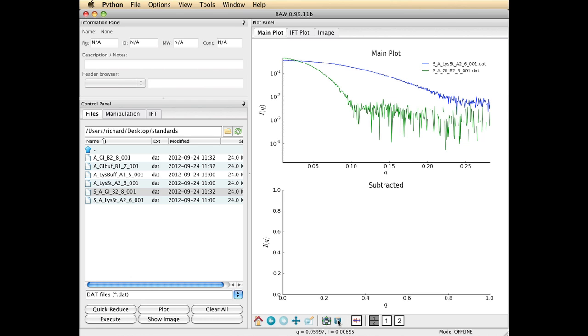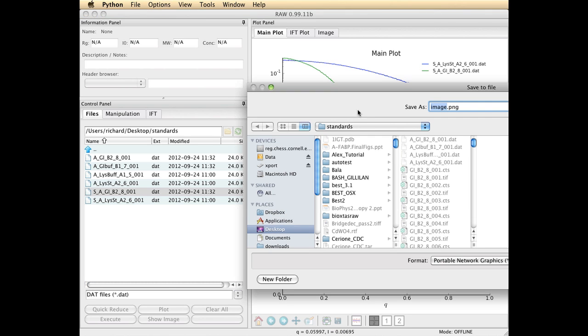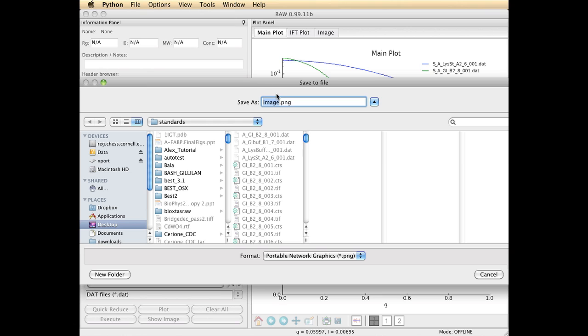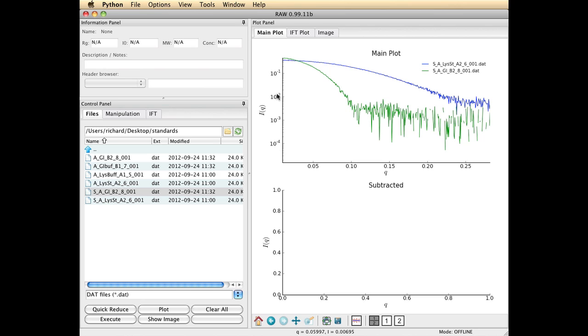The little disk icon here allows you to save your files at any time as PNG or other type format files. So I'm just going to go plot and save that in my directory.